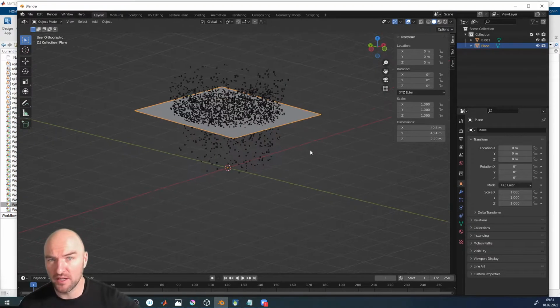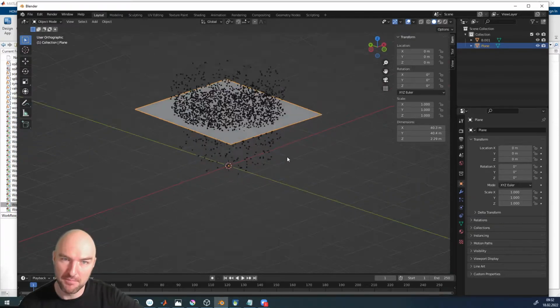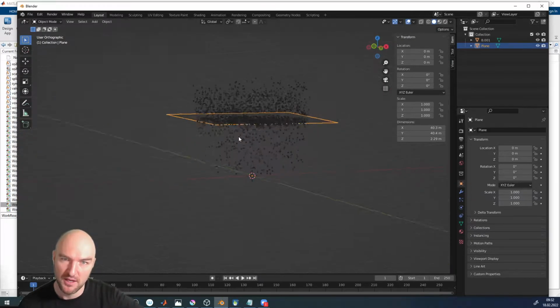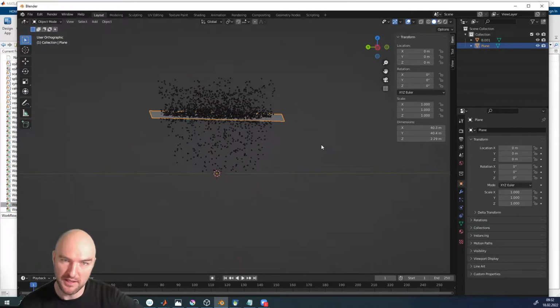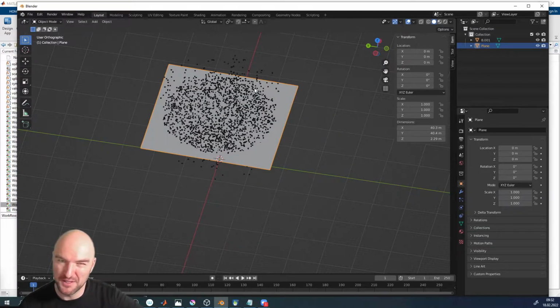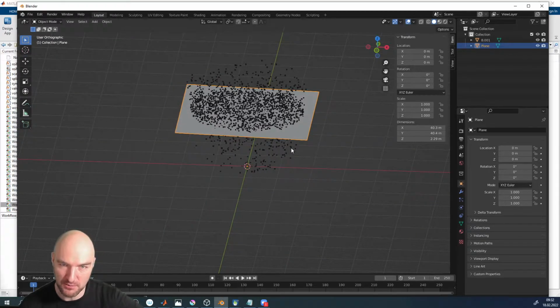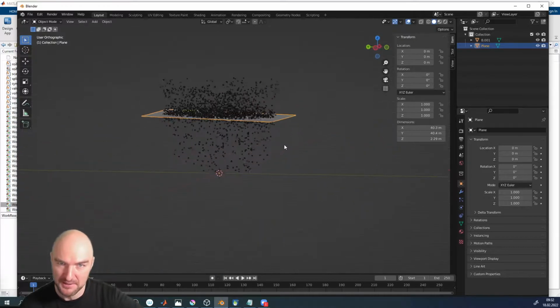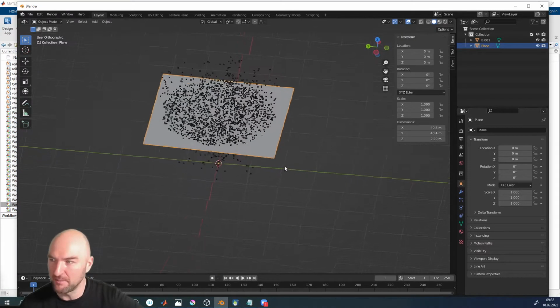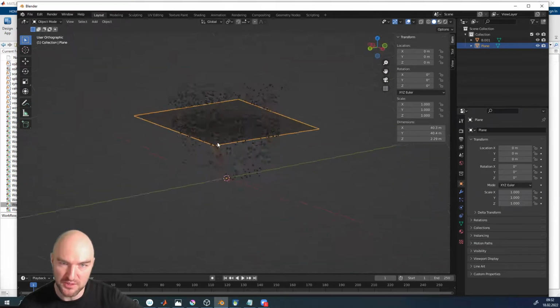But if you want to calculate any properties that are relative to the grain boundary area, obviously it's not a particularly good measure. If we calculate what the area is of that plane, it's obviously not the area of the grain boundary that we captured. Yeah. So we need to sort of cut it down to size a little bit.